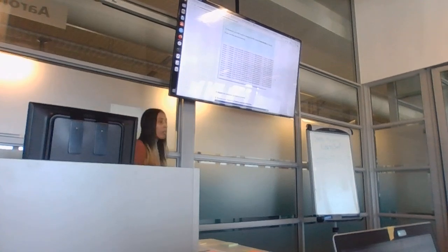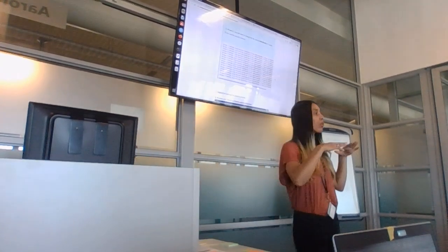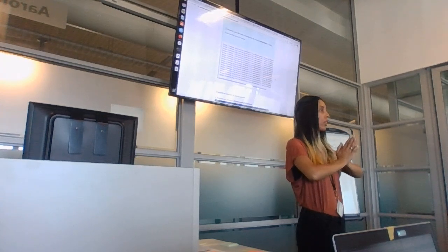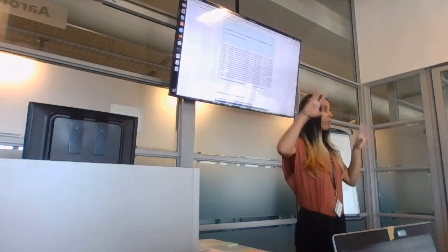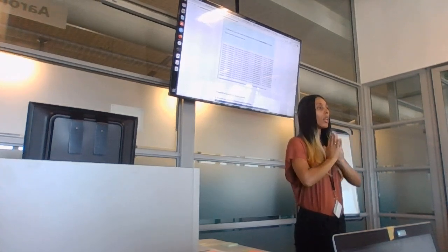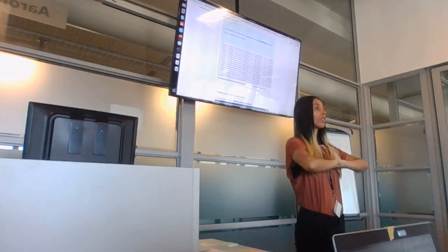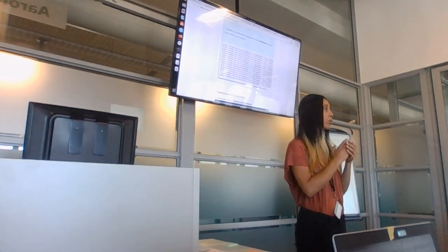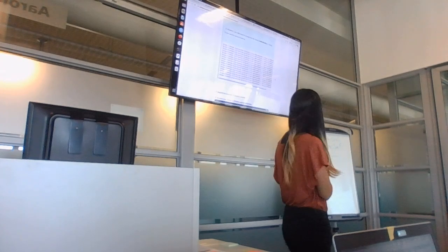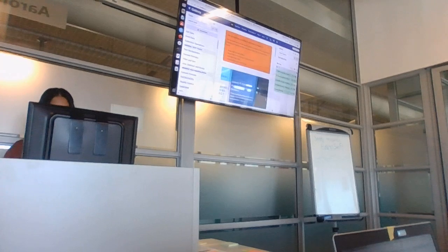Now, you've already downloaded all of these datasets in a zip file. Previously, we saw how to import data from a URL. Now you're going to see how to import data from your local machine. So let's make a new history, because you're going to work on a different dataset or different sample or do a different analysis. So you want to create a new history. Where would you go to create a new history? Plus. Okay, so create a new history.